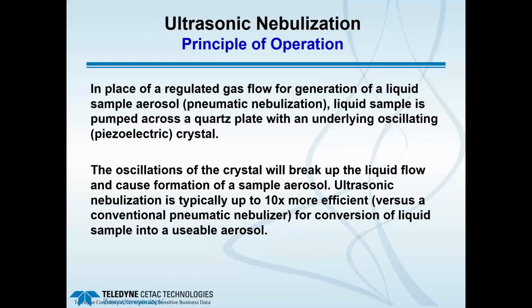Principle of operation of the ultrasonic nebulizer: in place of a regulated gas flow for generation of a liquid sample aerosol by pneumatic nebulization, the sample liquid is pumped across a quartz plate with an underlying oscillating piezoelectric crystal. So the point is, we're not going to use a gas flow to shear the liquid into a usable spray.